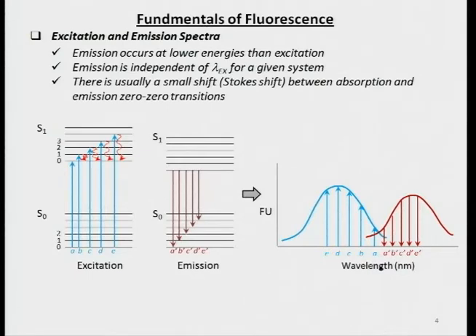These excitations are typically detected as a spectra in a spectrophotometer. In addition, you can do the fluorescence measurement also, and this should closely resemble the spectrophotometer. And that's the absorption spectrum, where A is the least energy, this is higher energy, this is even higher, and things of that sort.